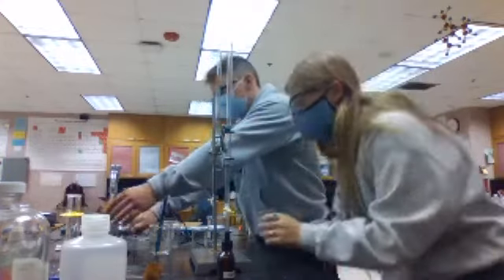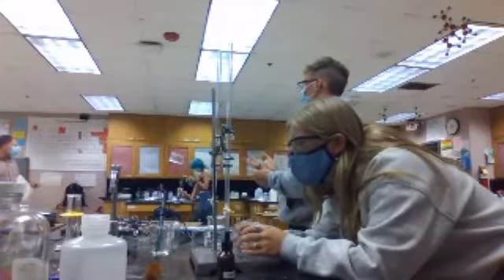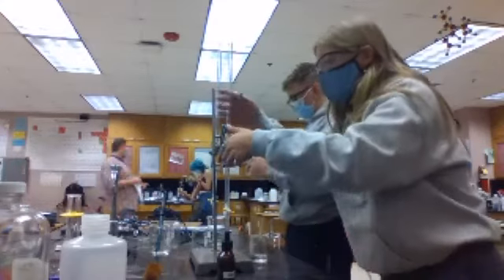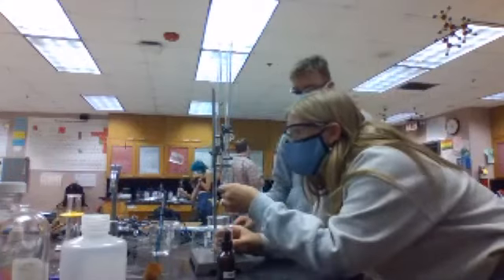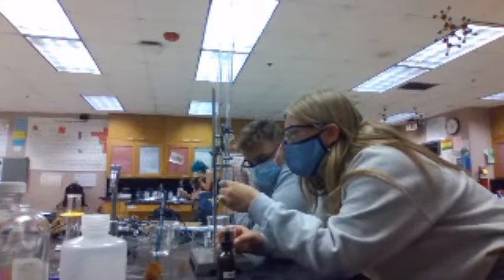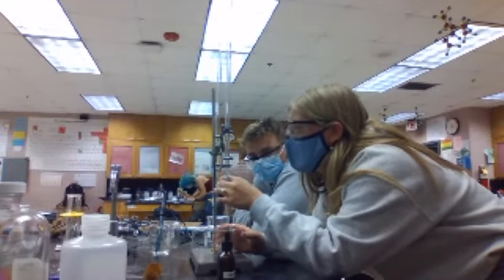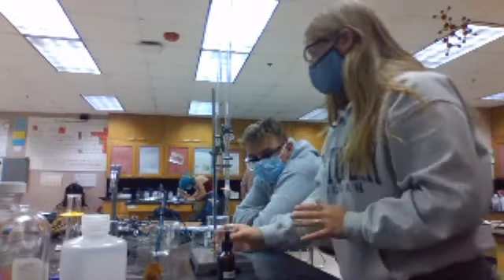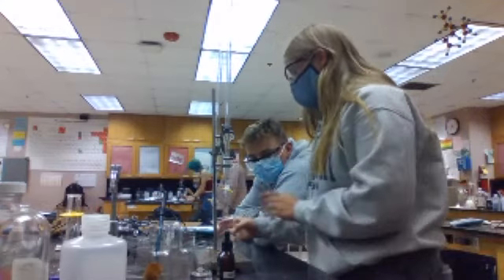That's one of the cool things about, did you guys actually find how many milliliters it should have been, using that square root thing? Yes. How many was it supposed to be? 15 milliliters for the base. 15. All right. We just got 10 milliliters. This is clean, right? Yeah.